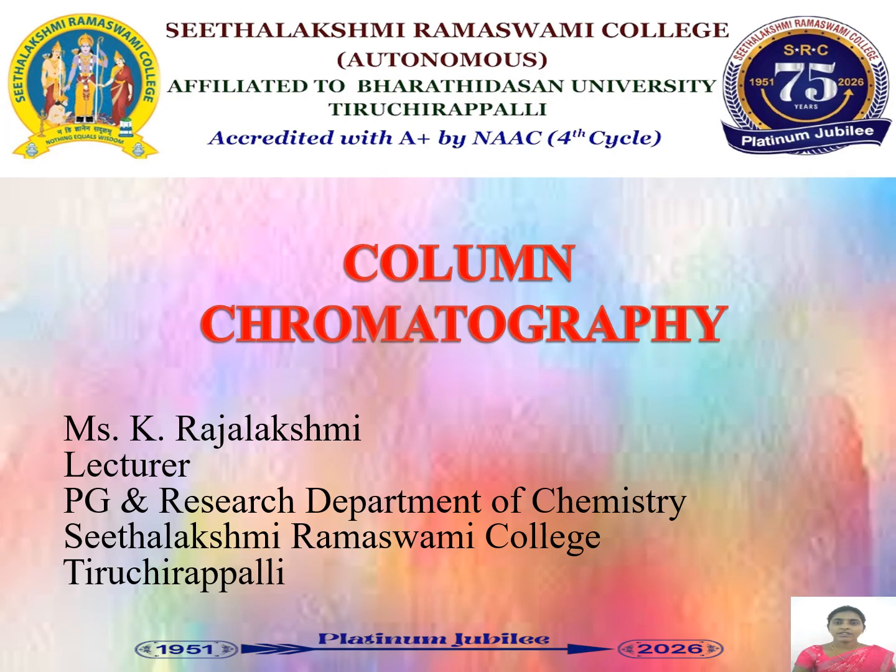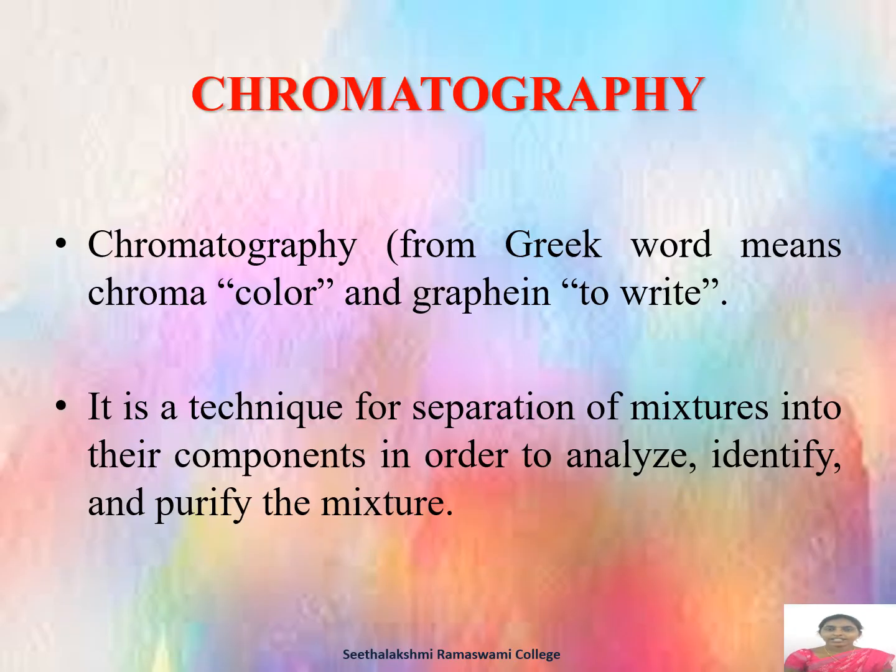In this video, we are going to discuss column chromatography. In this presentation, we discuss what is chromatography, origin of chromatography, types of chromatography, and what is column chromatography. First, the definition of chromatography. Chromatography is a Greek word meaning color writing. Chromo means color, graphein means write. Chromatography is a technique for separation of mixtures into their components in order to analyze, identify and purify the mixture.